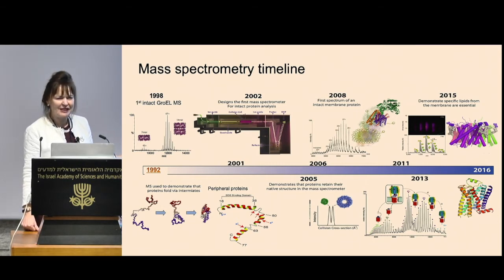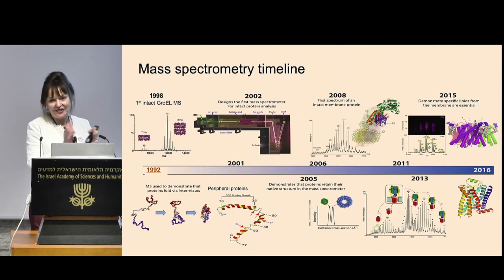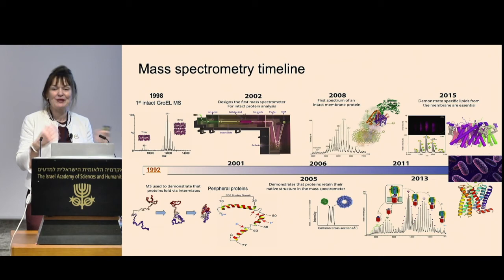And you might think, well, why did it take so long? And that's because, again, if you take them out of the membrane, there's not much to support them. They're very floppy, very hard to get the drugs and the lipids to stay bound. And then very recently, excited by the mitochondrial opportunities.